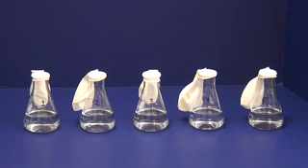Each of these flasks contains 70 milliliters of vinegar. Each balloon contains baking soda. The first balloon contains 2 grams, the second 4 grams, the third 6 grams, the fourth 8 grams, and the last 10 grams. What do you predict will happen when the balloon is raised and the two reactants mix?